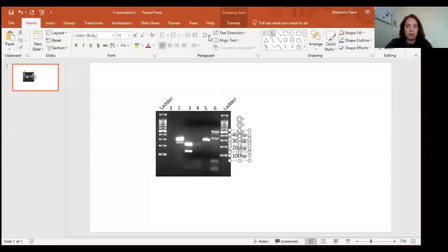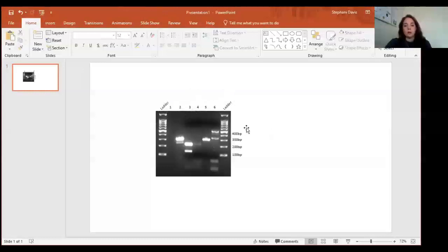Just gonna reduce that font size a little bit. All right, so 100, 200, 300, 400, and 500.